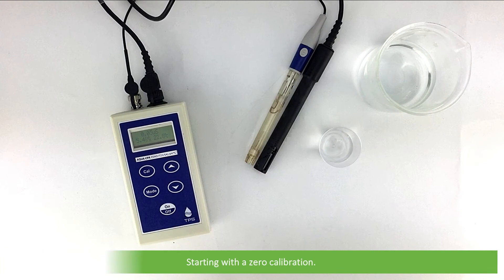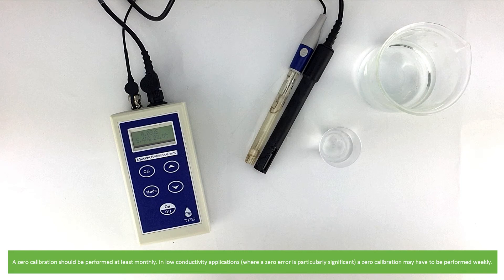Starting with zero calibration. A zero calibration should be performed at least monthly. In low conductivity applications where a zero error is particularly significant, a zero calibration may have to be performed weekly.